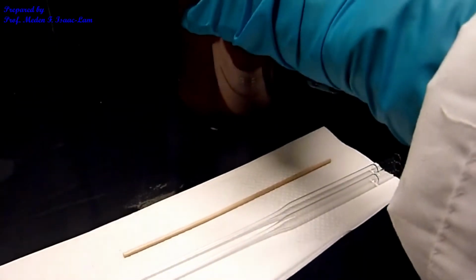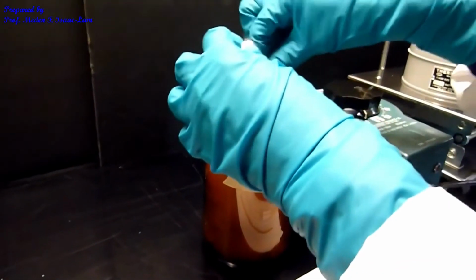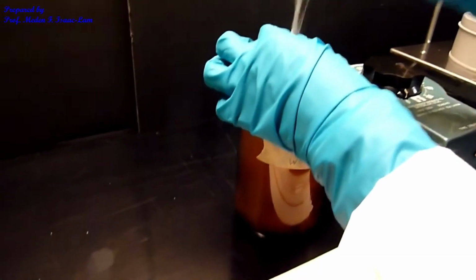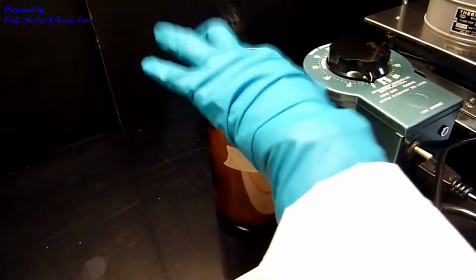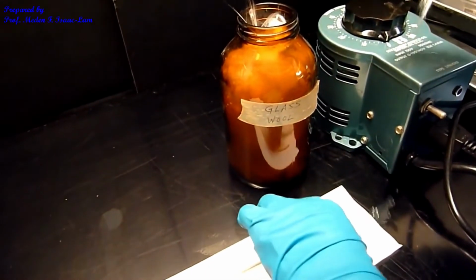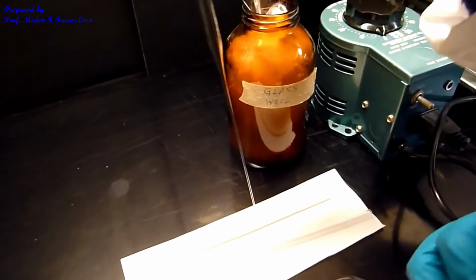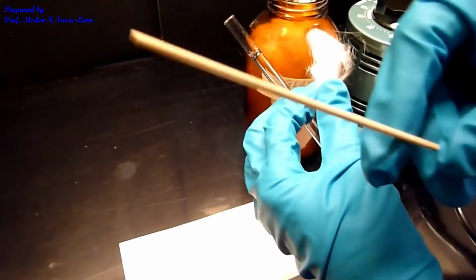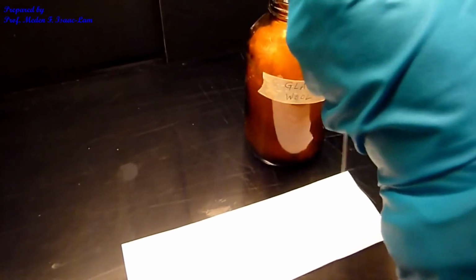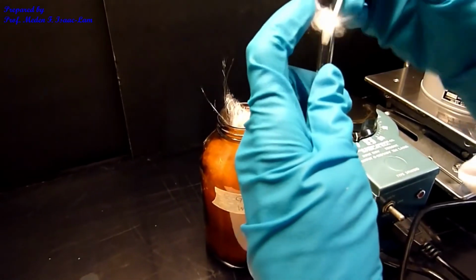And I'm going to set up a filtration using a little bit of glass wool. So this is glass wool. And I have here 2 pipettes, and then it's a Pasteur pipette, and I'm going to use a boiling stick, and I will put a little bit of the glass wool inside.